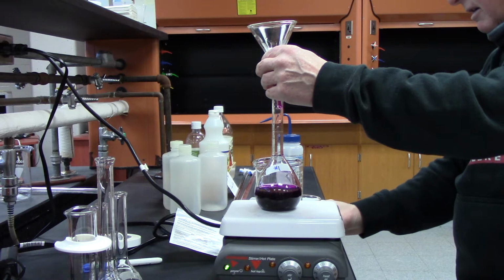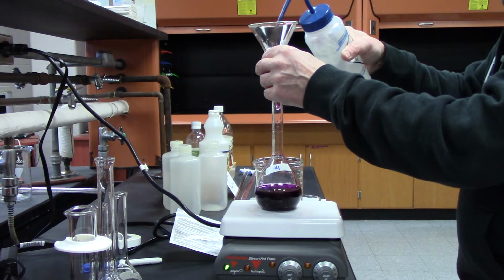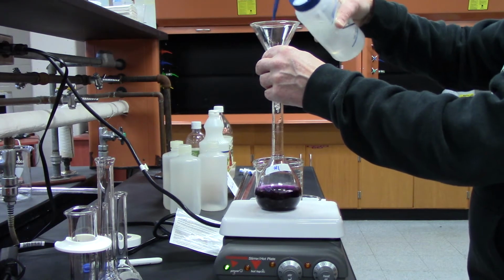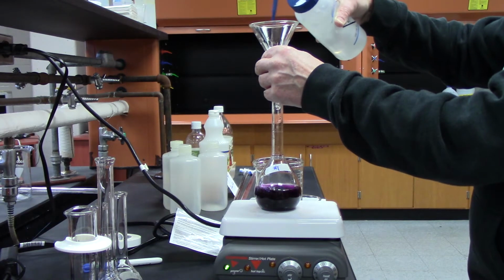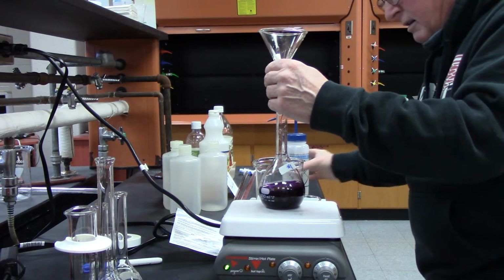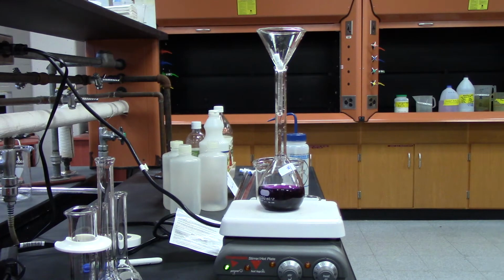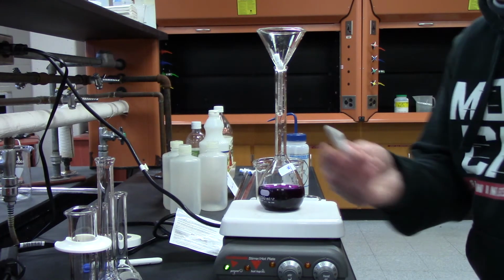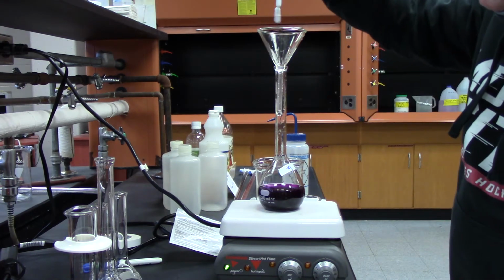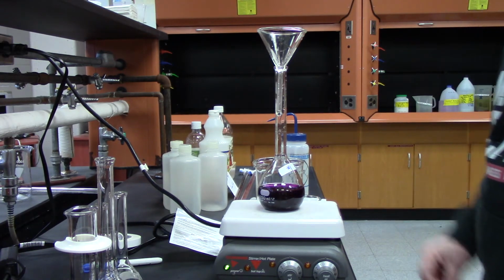Alright. Now there's still some of my liquid in this funnel, and I even had my stir bar fall in there. So I'm going to rinse out my funnel and my stir bar. And now I want to take out my stir bar. What I do is I take a bigger stir bar and just take it out like that. Set it aside. Okay, next step.